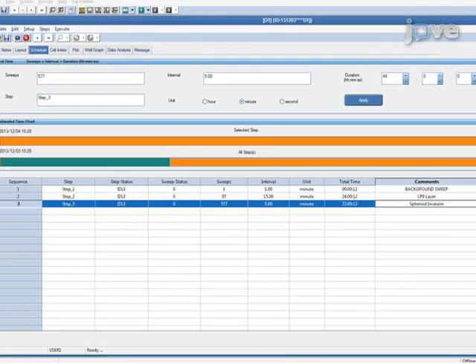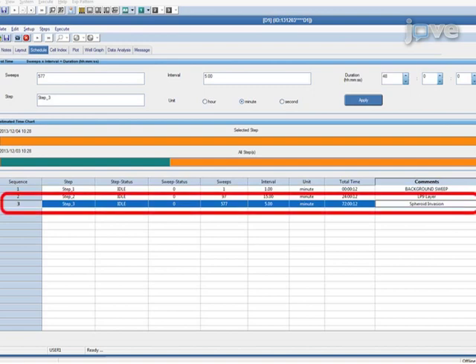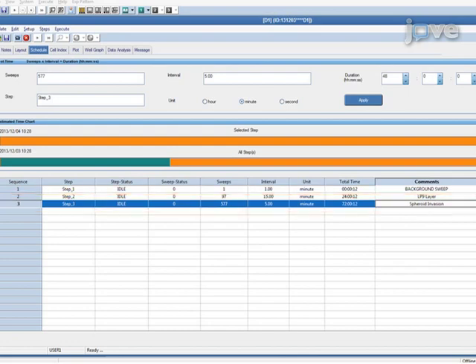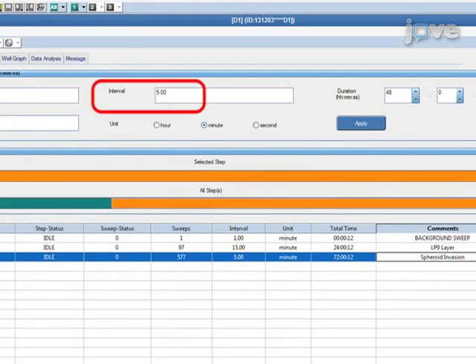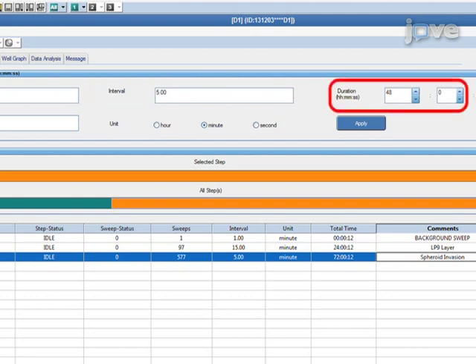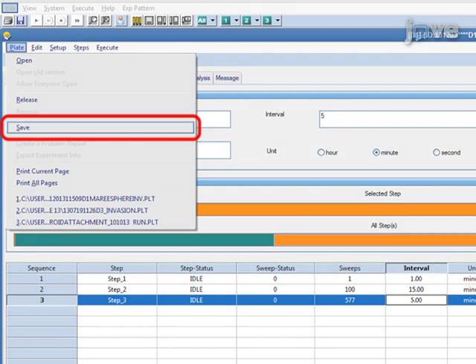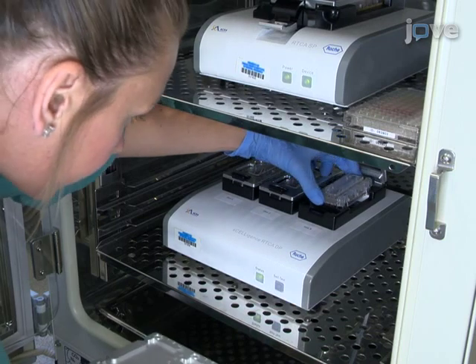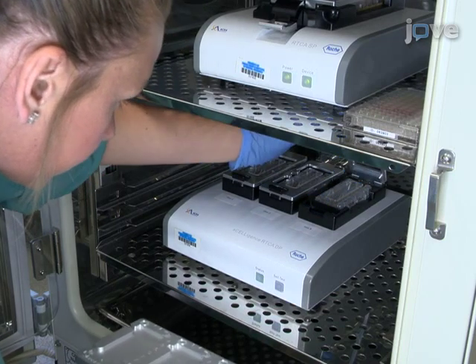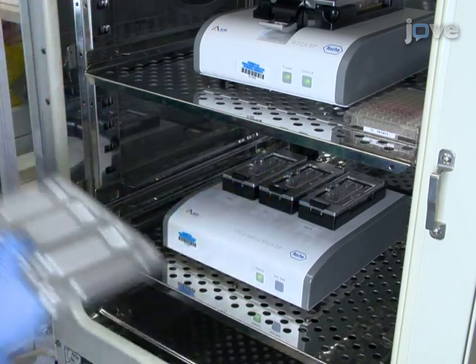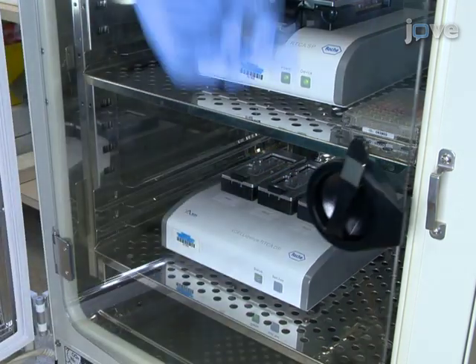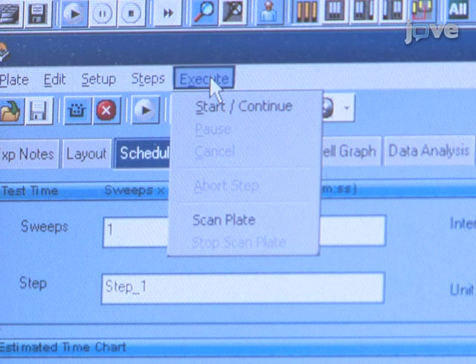Subsequent steps are added in the same way. Step 3 of the RTCA program will direct the instrument to take readings during spheroid invasion. Enter 5 minutes under the Interval tab and 48 hours under the Duration tab. Select Plate on the menu bar and save. Then place the CIM plate in the RTCA instrument and open the saved program.